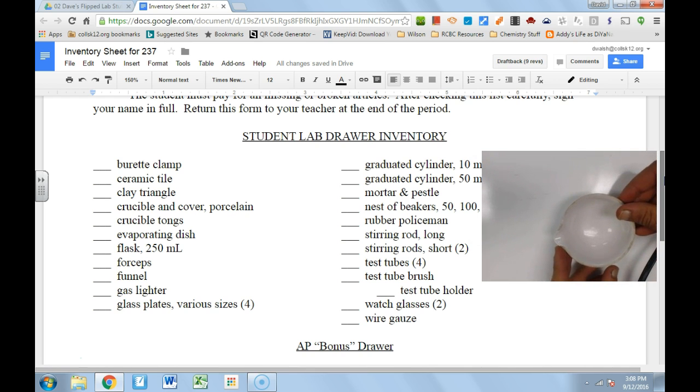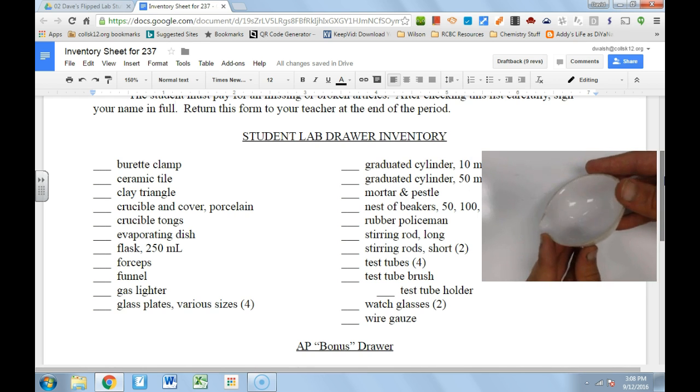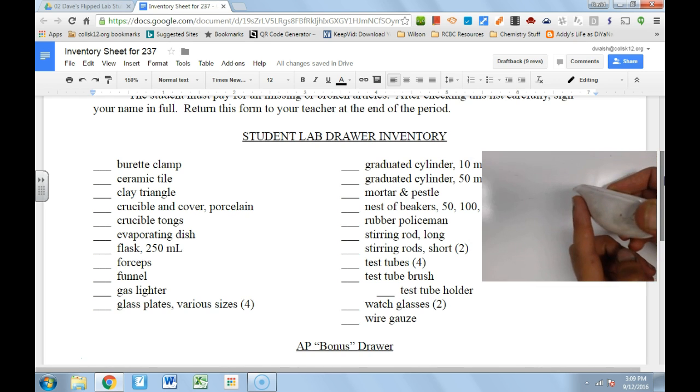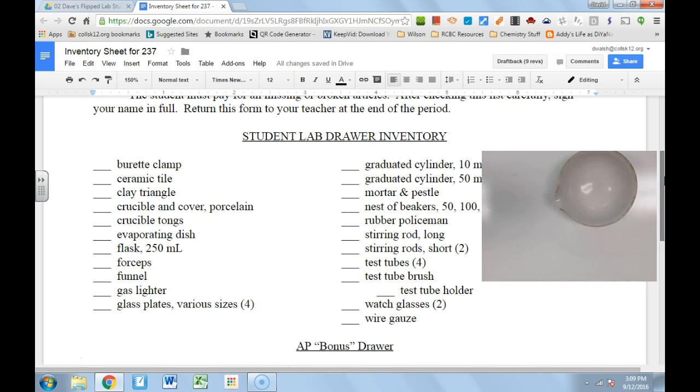Continuing with ceramics, we have our evaporating dish. Your evaporating dish is basically a ceramic dish with a little pour spout. As its name says, it's good for evaporating things. If you have a liquid and you want to evaporate it, throw it in your evaporating dish and heat it up.